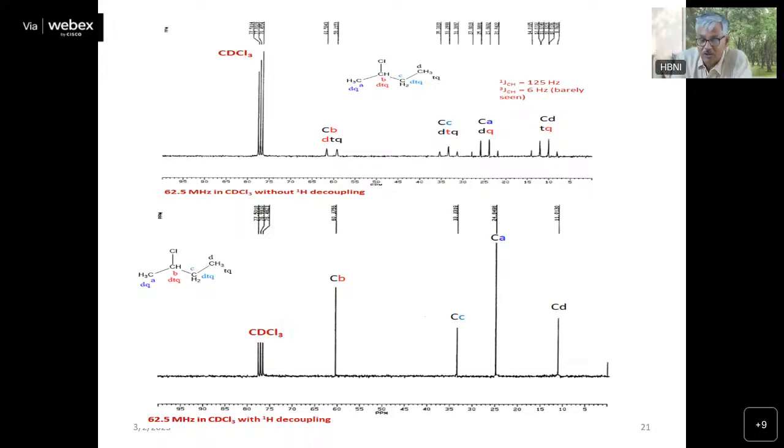And that's why you see that all carbons now have different intensities, and I have already mentioned why carbon 13 spectra are not integrated: because of the nuclear Overhauser effect and the relaxation time. I will discuss those things later on. The most important thing here is the CDCl3 peak. Okay, it gives you a 1:1:1 triplet.